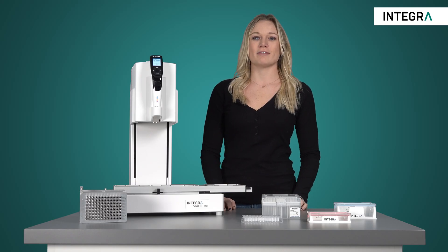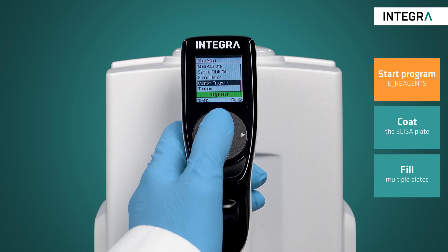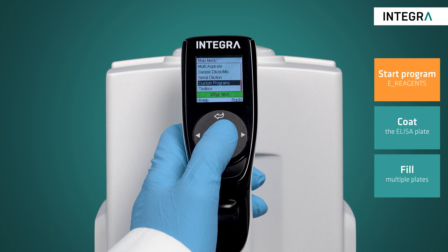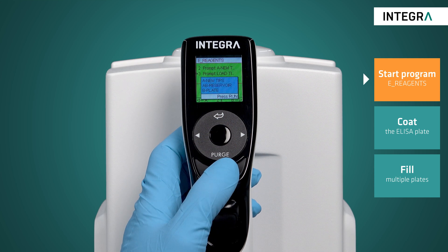To demonstrate this, we'll be using a ViaFlow 96 together with a 96 channel head with a volume range of 10 to 300 microliters. All the steps needed to run this ELISA protocol are saved as a custom program on the instrument, containing all the necessary settings to remove any guesswork.